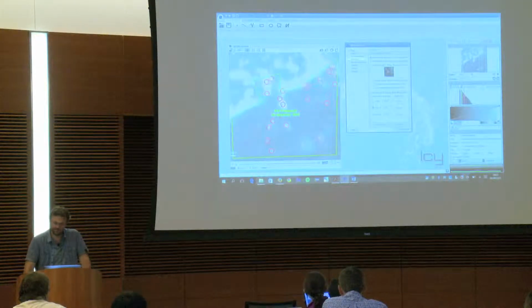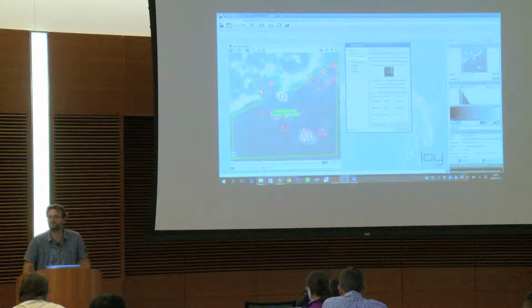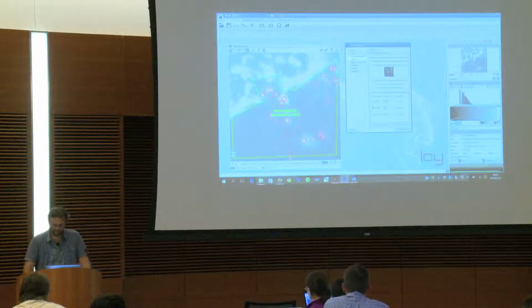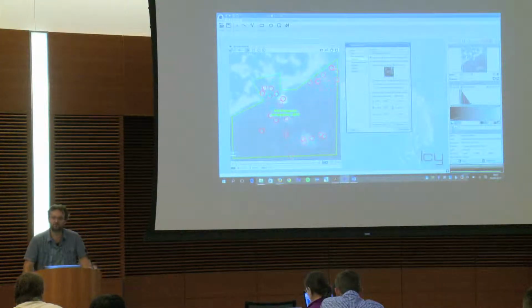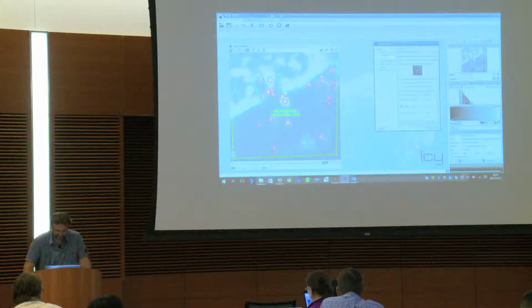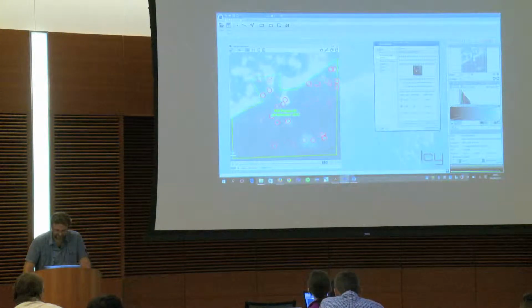This thing? Yeah, 140. If you put 100, it means that you are fully confident in the measurement of the wavelet estimator. If not, you amplify or decrease the number of detections that you will have. And now I have this result. Look at this, I'm very happy. Why should I even need to track this? Because I have all my results.